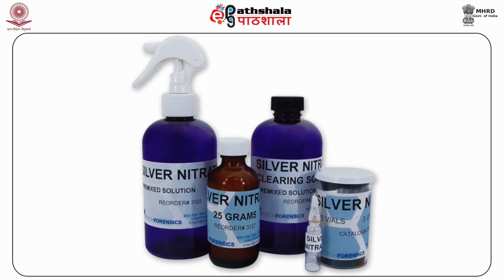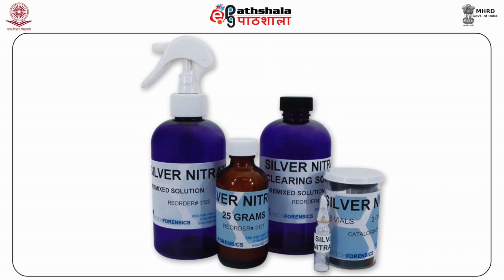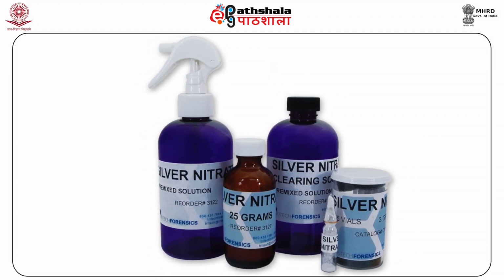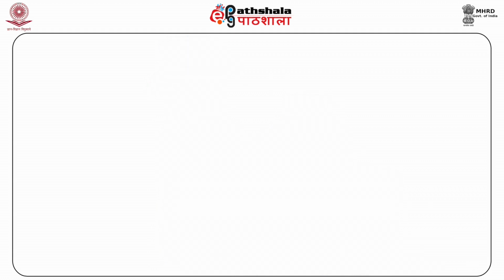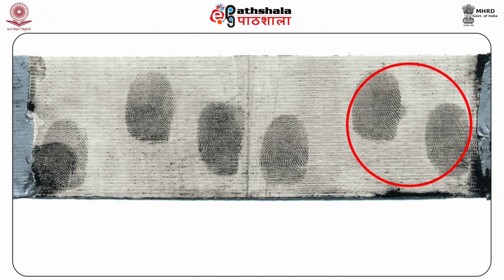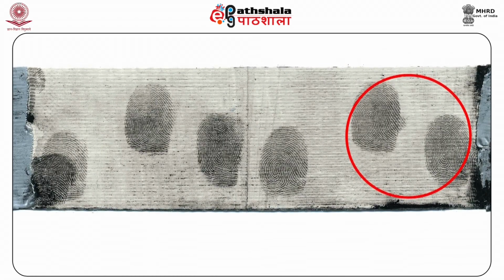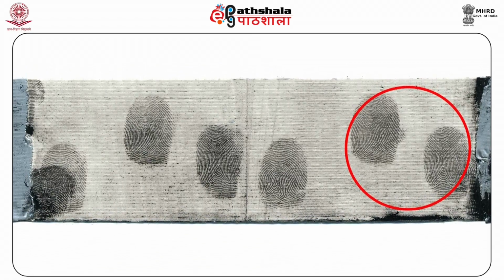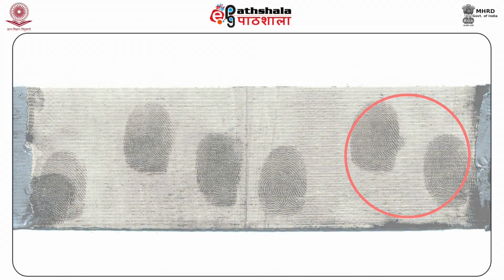The technique derives its name from the photographic physical developer, which during processing of film roll undergoes a similar reduction reaction. The physical developer reveals the fingerprints as dark gray or black images due to the adsorption of metallic silver particles on the fatty acid and lipid components of sweat residue.